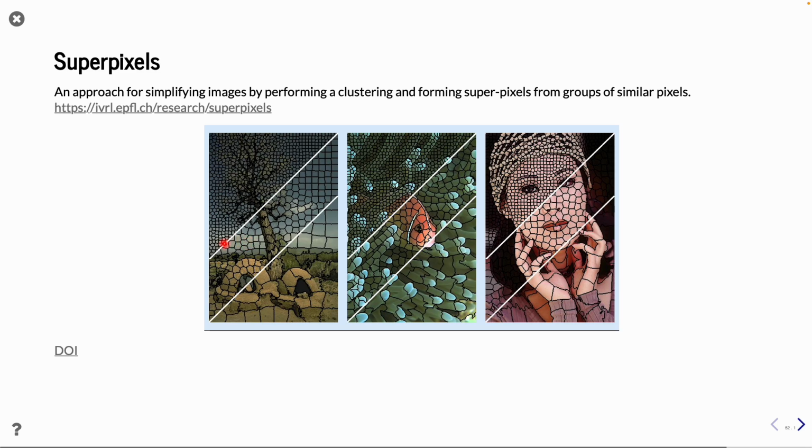You can see here that it's more like a mosaic style, and afterwards you can decide how large these pixels should be, depending on what level of detail you need to look at. You can see the upper corner is fine-grained, and the lower part is really coarse, and the more you get into the features, the larger the regions.